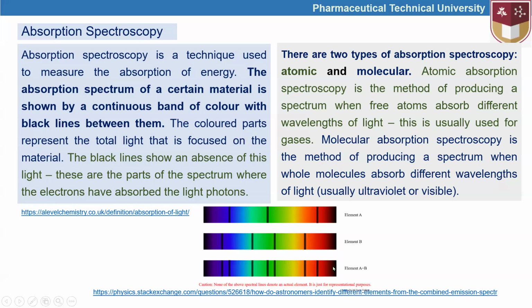By analyzing the absorption spectra of many atoms, we can identify the presence of some atoms. If the absorption spectra of all atoms are gathered in one bank, it can be easily and automatically identified whether some elements are present based on their absorption spectra.